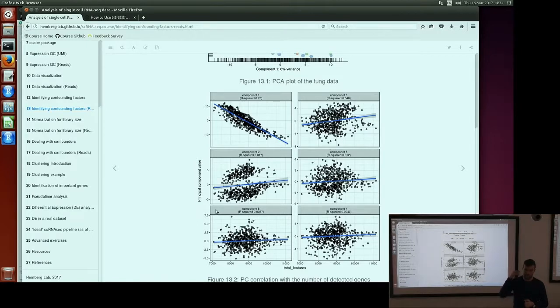For visualization and discussion purposes, we were showing what it looks like if you do PCA on log2 counts without this normalization of library size between cells. But by default in the package, we do that because in general, and this is true in bulk as well, there are always differences in sequencing depth and therefore library size between samples.